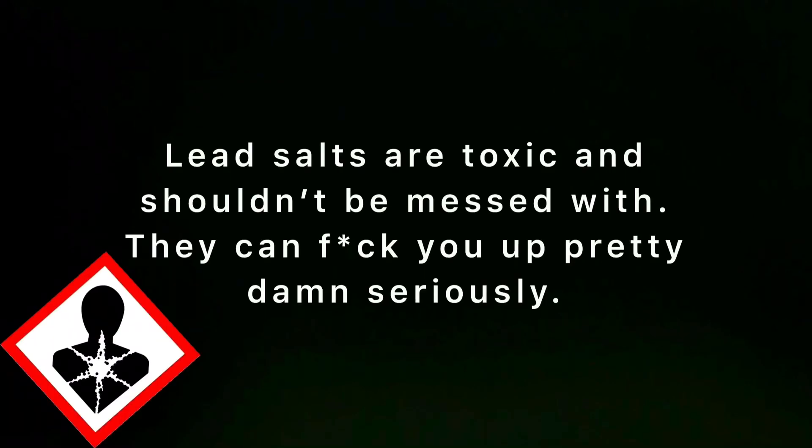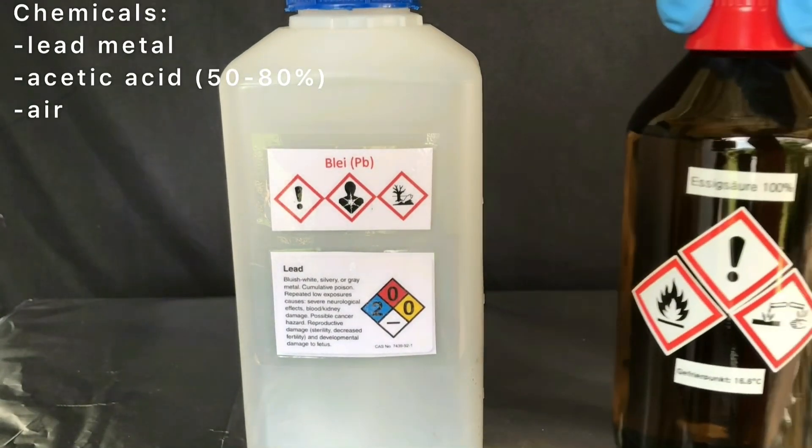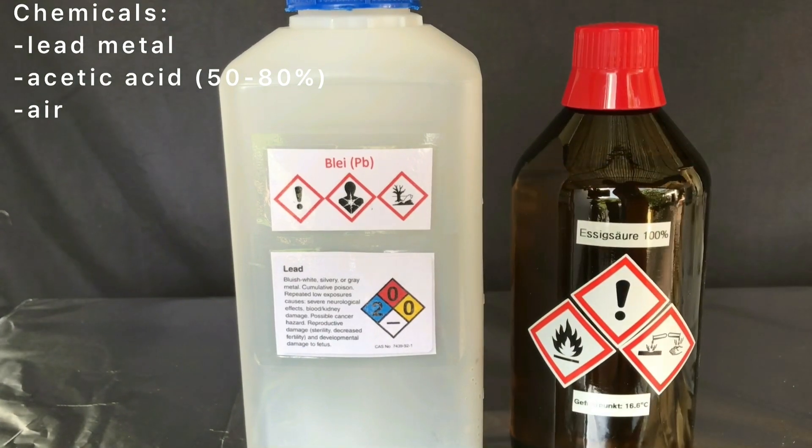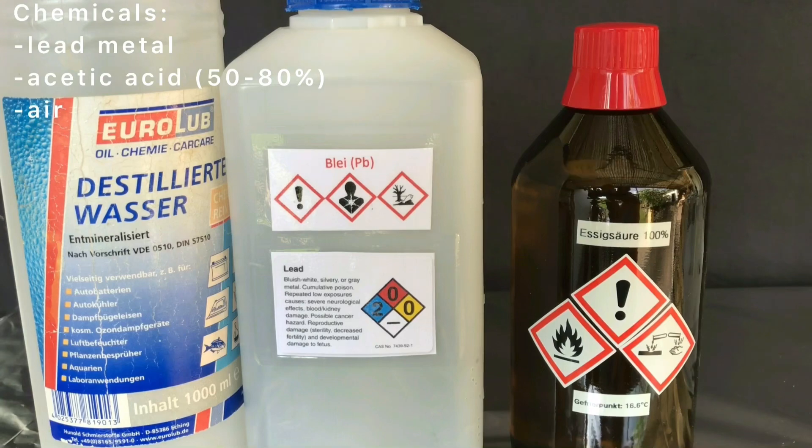Today we are going to make some lead acetate from easy-to-obtain materials. Keep in mind that lead salts are toxic and should definitely not be messed with — I have a huge respect for water-soluble lead salts. For this preparation, lead metal, 50–80% acetic acid, and air are needed. I used glacial acetic acid and distilled water to make my dilute acetic acid.